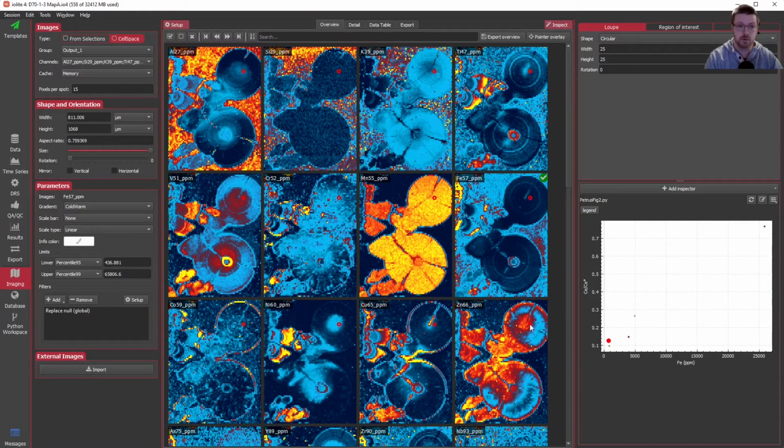So we're getting fairly low. Yeah, that makes some sense. Values appear to be in about the right range. And there is a bit of a correlation between the two. Okay, so that's pretty much already that figure recreated.